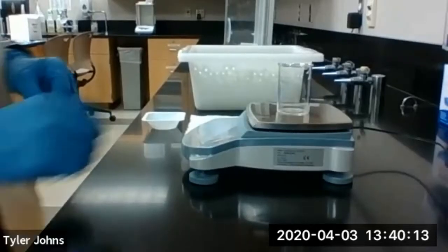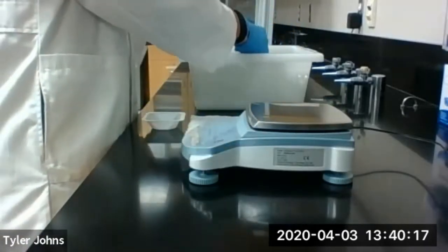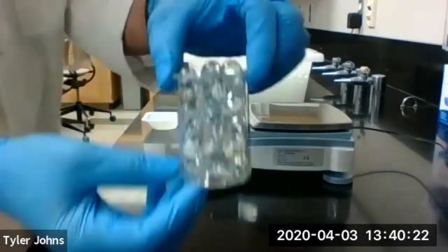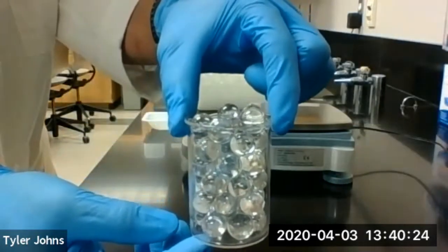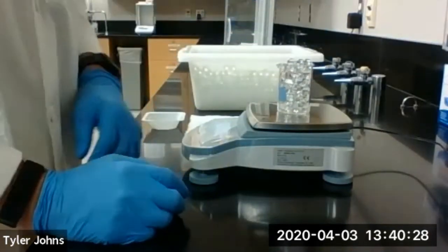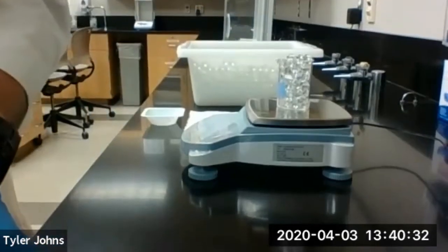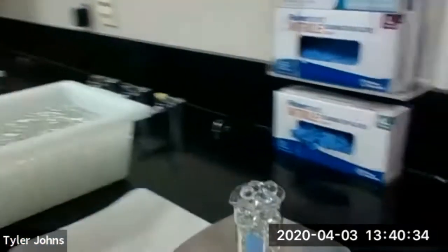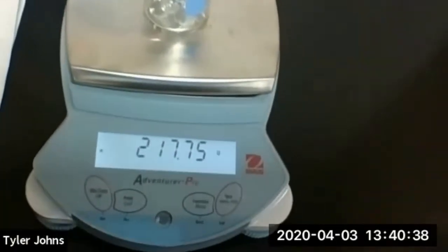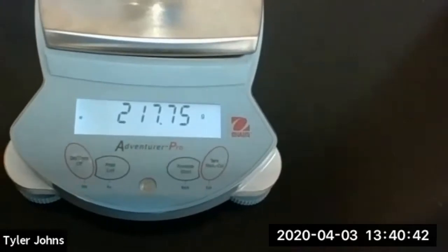Okay, so next we're going to fill the beaker with marbles. We have our beaker full of marbles now. And we're going to determine the mass of the beaker with the marbles. So the mass of the beaker plus the marbles is 217.75 grams.